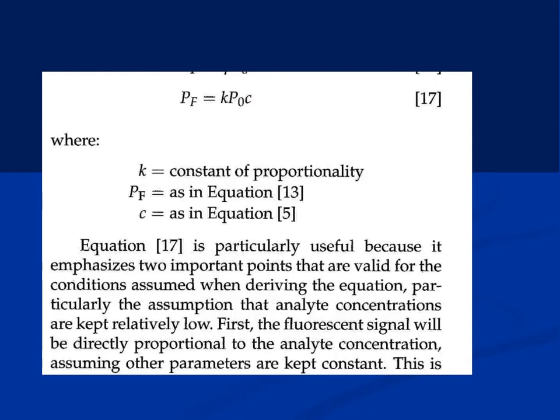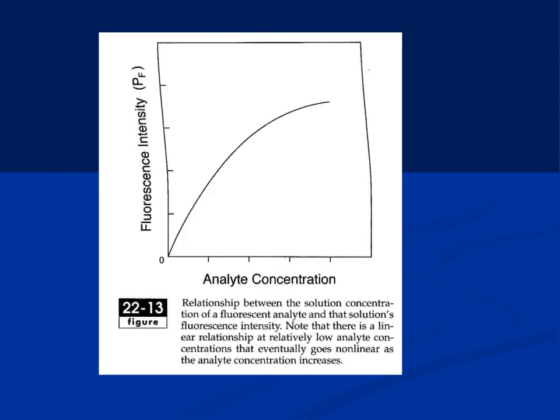So it's the same thing, but the formula is a little bit different. It's basically showing you that it's related to the concentration, and you can plot standard curves, and you can use the same technique you use for the UV spectrophotometer and apply it over here. But the concentrations are really low. That's why it's a very sensitive technique. Be careful when you are plotting this.